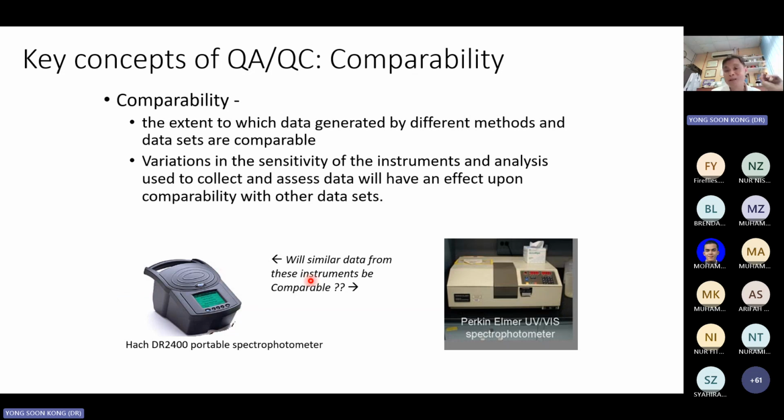Zero. But when you bring it back to the lab and analyze again using more sensitive equipment, it shows a little. You can see a little. But that's it. You also need to be very careful of what equipment you have in hand, and is that equipment adequate? Sesuai tak? In reality, even this was voiced out by a professor in a research university: a lot of students don't realize that the equipment they're using is not sensitive, and whatever data they generate is not useful.